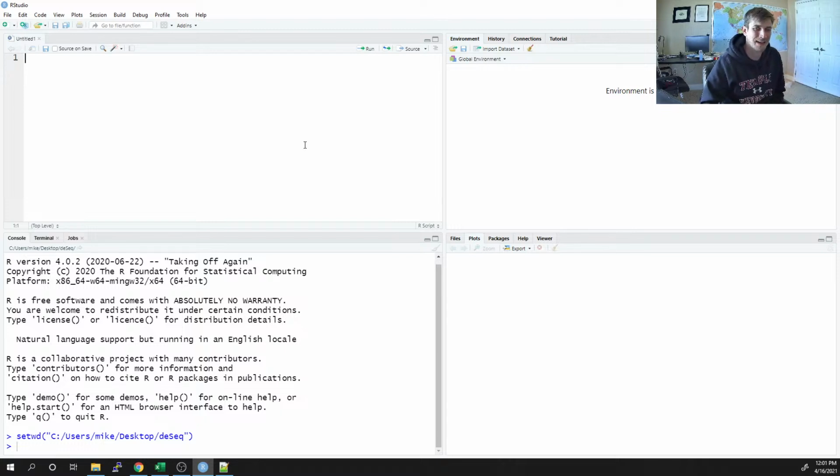So today, what I'm largely going to be doing is just replicating some plots, so we can look at our expression data a little bit better. There are a handful of tools, a part of the DESeq package, that let you visualize your data, like plotMA.